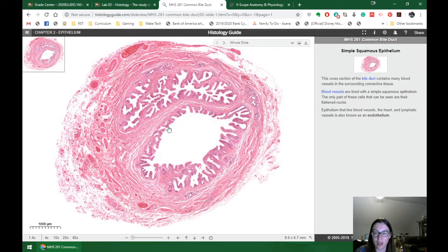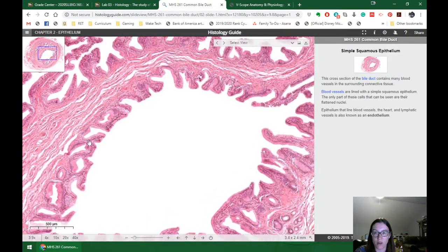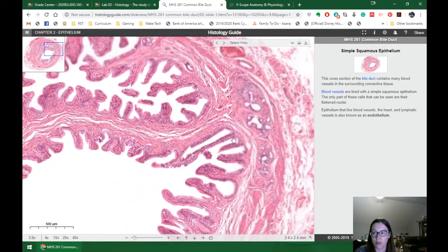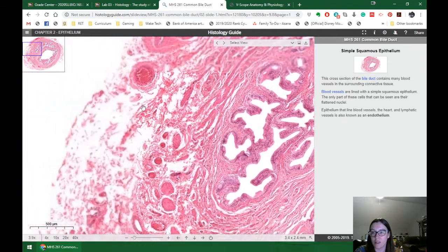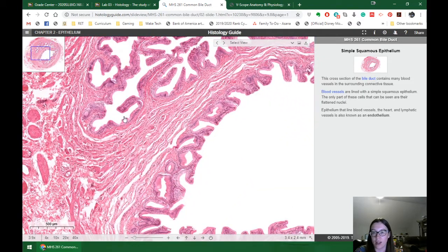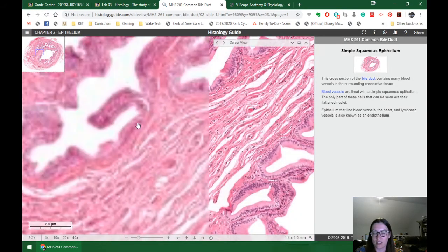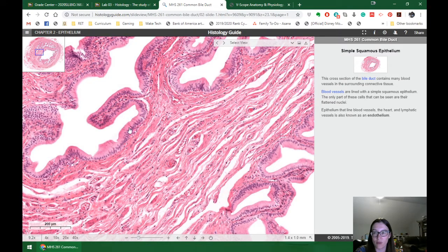Some of it is going to be epithelial tissue, right? But some of it's going to be connective tissue under there, and it's really nice because you can move around in this whole slide. There's blood vessels in there. So we have epithelial tissue as well as connective tissue. You can look at these slides, but it gets a little bit more confusing if they're not labeled. So that's why I'd say maybe start with APR and start with the V-scope that goes through, and you can watch the videos with everything and then look at these later.